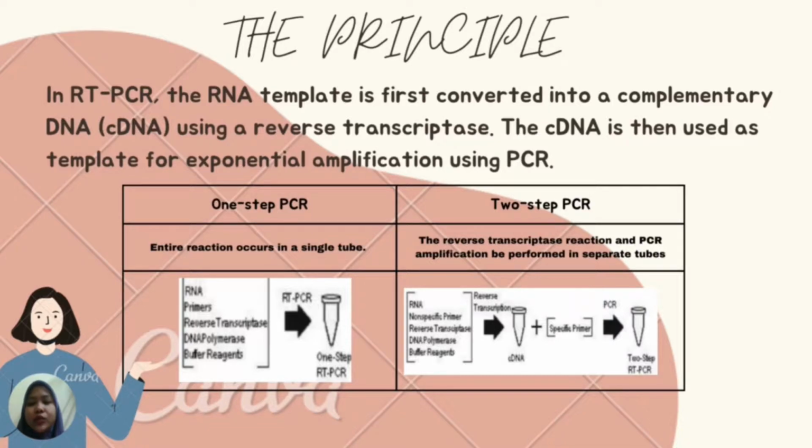Place PCR tubes in the thermal cycler to begin cycling. The first cycle is reverse transcription to synthesize the cDNA. The second cycle is initial denaturation. During this cycle, reverse transcriptase is inactivated. The next 40 to 50 cycles are the amplification program, which consists of three steps, which are denaturation, annealing, and elongation. The RT-PCR products can then be analyzed with gel electrophoresis.